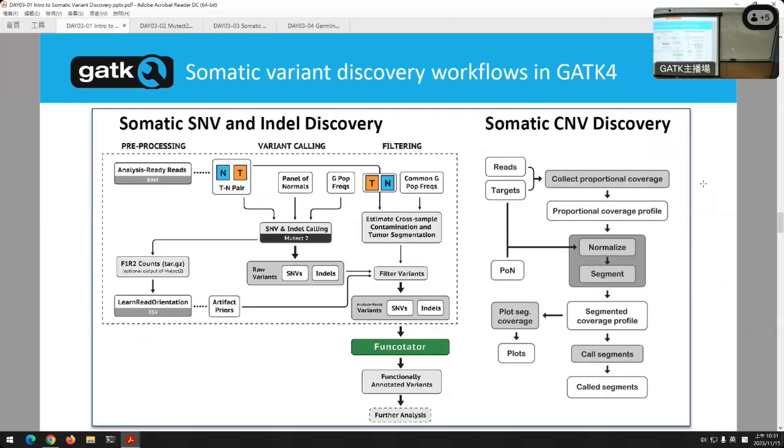Okay, so remember how, in the initial thing, we had just HaplotypeCaller before. It was one step. That one variant calling step, HaplotypeCaller, now gets turned into a whole big box. There's a lot that gets done in the somatic mutations. Now, again, we have workflows I'll set up with you.